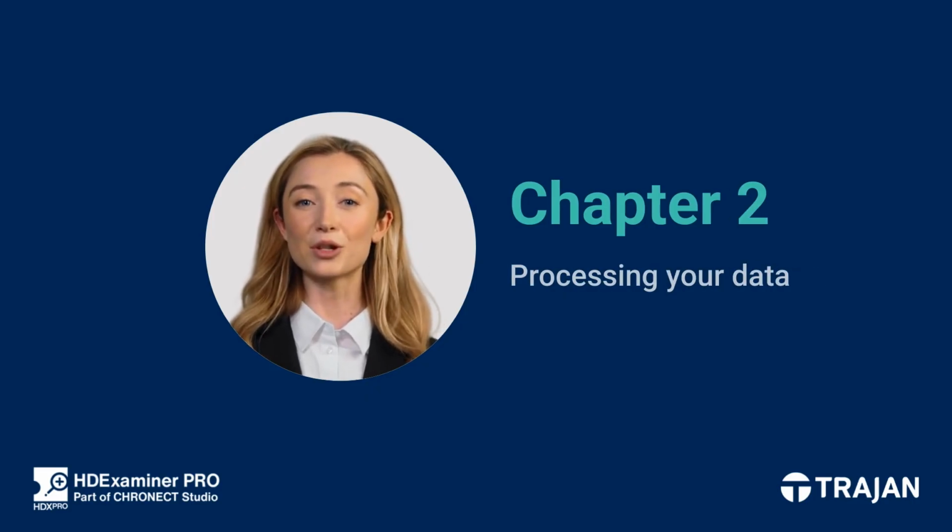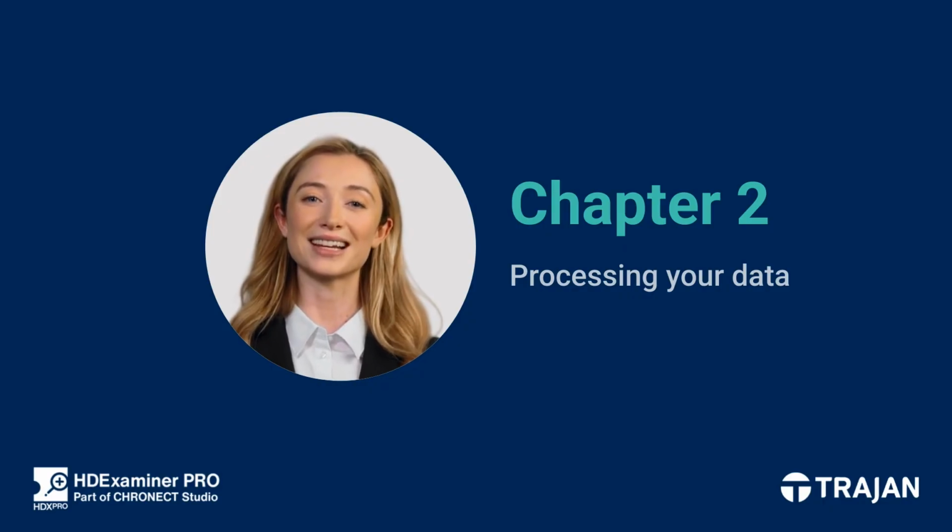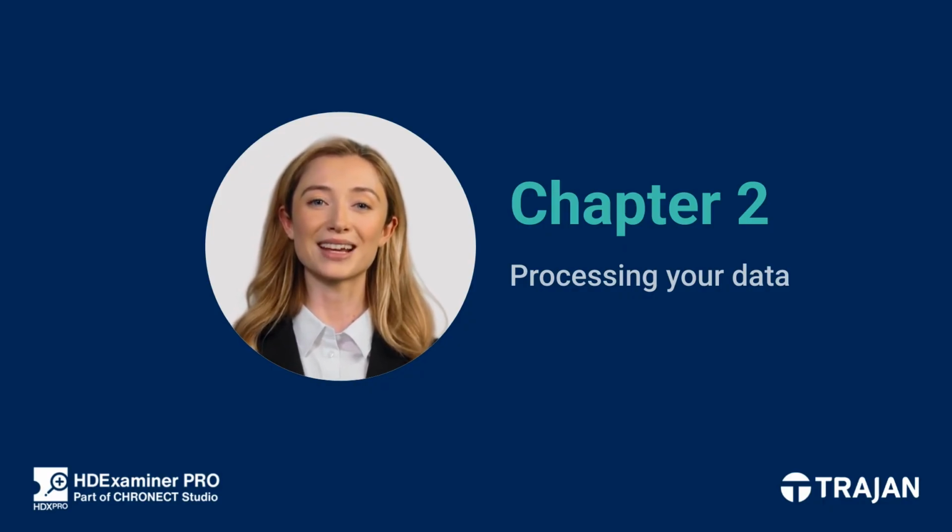In Chapter 2, we'll show you how to set up processing parameters and give you a high-level overview of what the HDX data processing workflow looks like and what kind of results you can expect. When you're ready, let's continue.